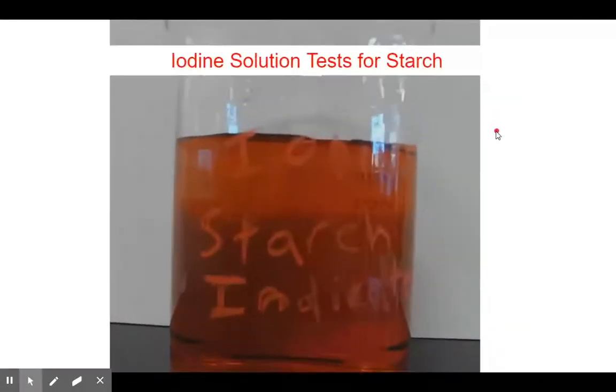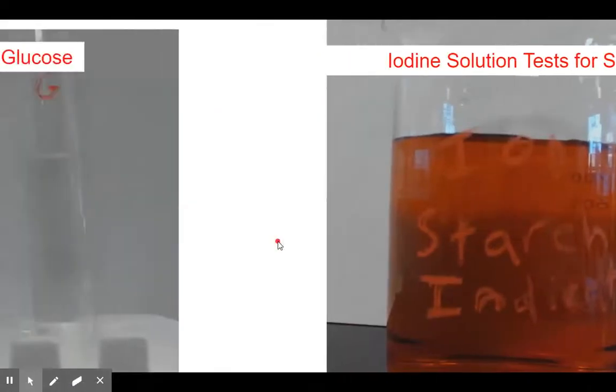The next thing we're going to do is test for starch. We're going to be using an iodine solution that is an amber color. Right now when we dilute it in water, it's going to have a lighter yellow color, and we're going to see what happens in the presence of starch. It's going to turn into a purple or black color only in the presence of starch.